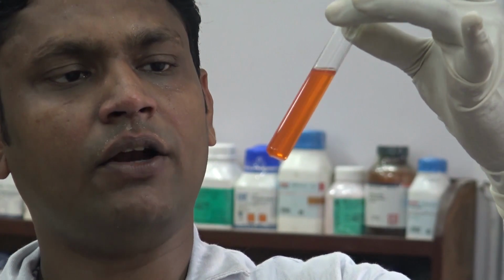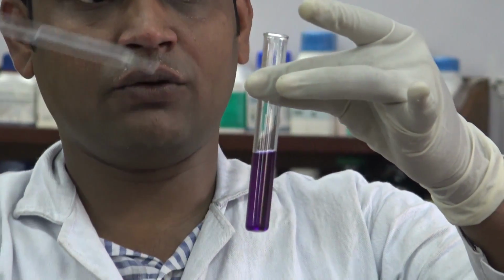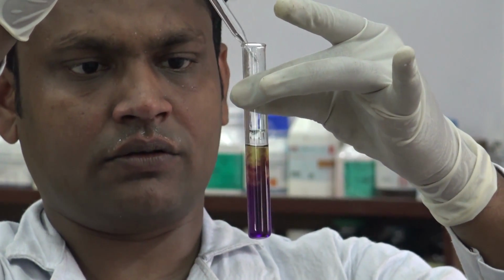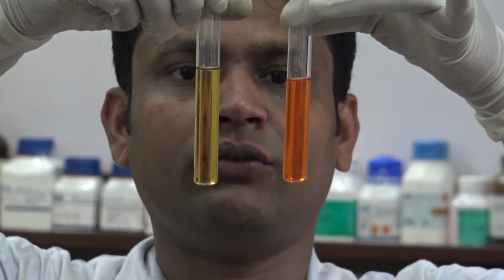After addition of acetic acid, the violet color turns red. Let's see with the blank test. Similarly, we are adding acetic acid. Here we can clearly see the changes with the aluminium and with the blank test.